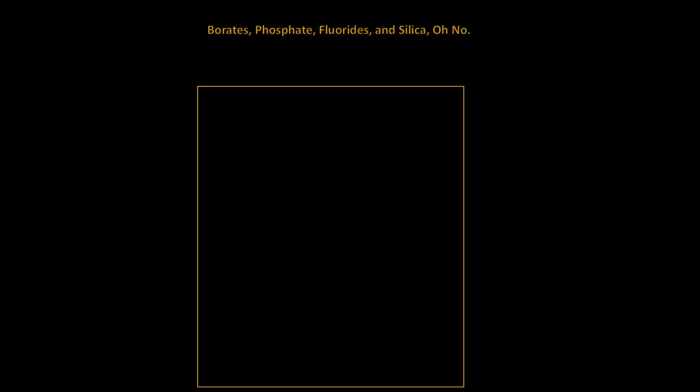Elements such as magnesium, calcium, barium, strontium, zinc, as well as manganese, will precipitate out as phosphates, along with the hydroxides. Therefore, their removal is necessary and should be completed after the group 2 separation and before the group 3 procedure. This is carried out by boiling the group 3 solution, but do not boil it dry.